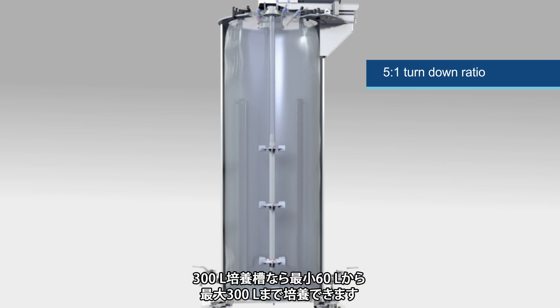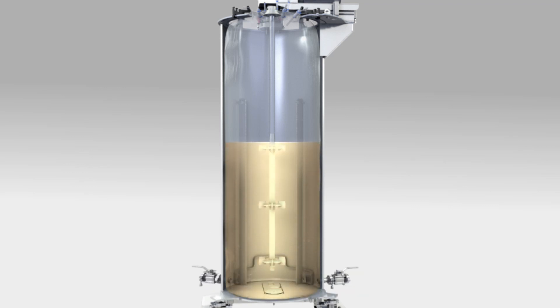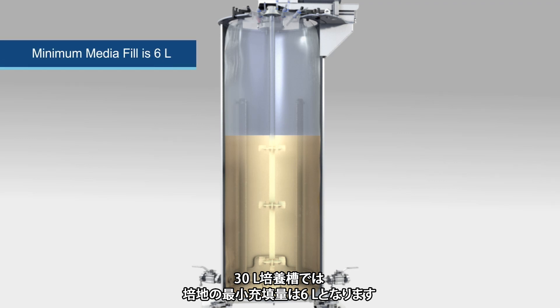The SUF has a 5 to 1 turndown ratio. Therefore, the 300-liter vessel can be operated with as little as 60 liters and up to 300 liters. The minimum media fill for the 30-liter vessel is 6 liters.